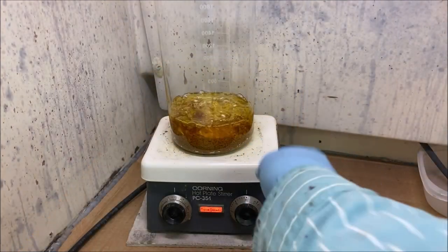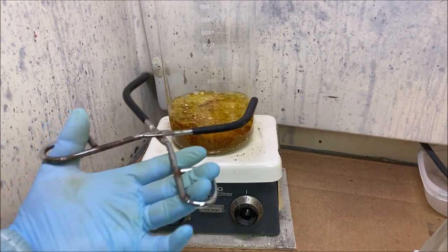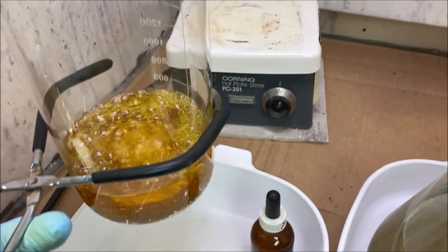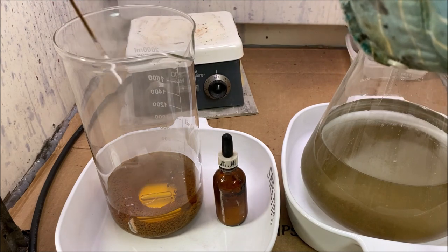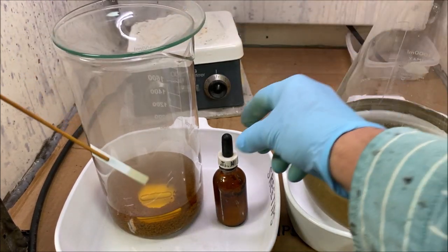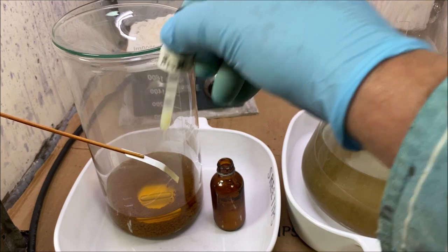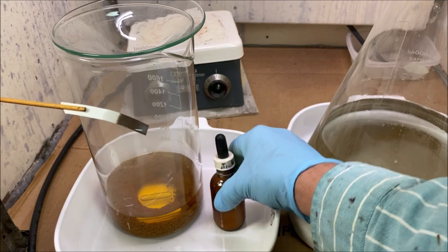This has been on boiling for about 10 minutes. I'm going to take it down off the heat now. Let it cool off for a second. Okay, the question is, will boiling hydrochloric acid put gold in solution? Get a little bit on this piece of filter paper, test it with some stannous. And the answer is yes. Quite a bit, actually.